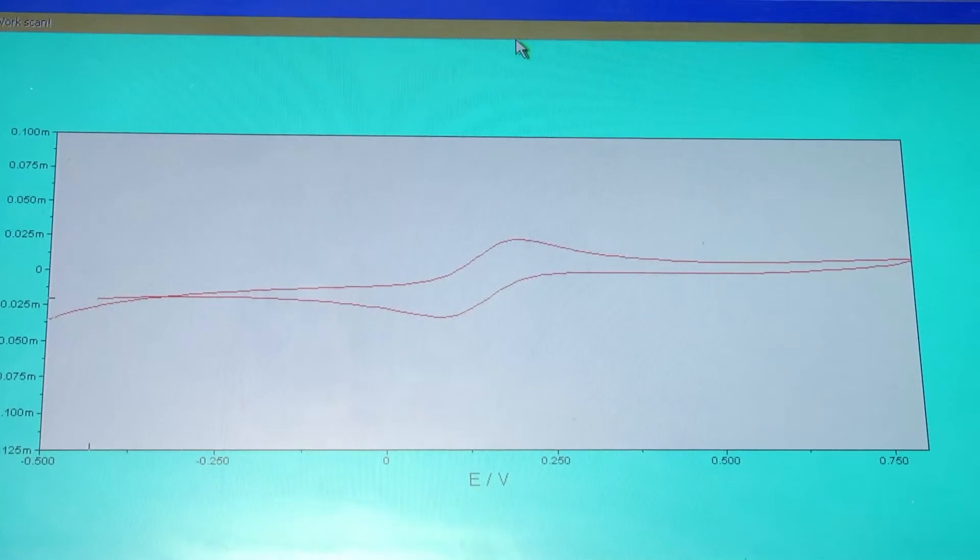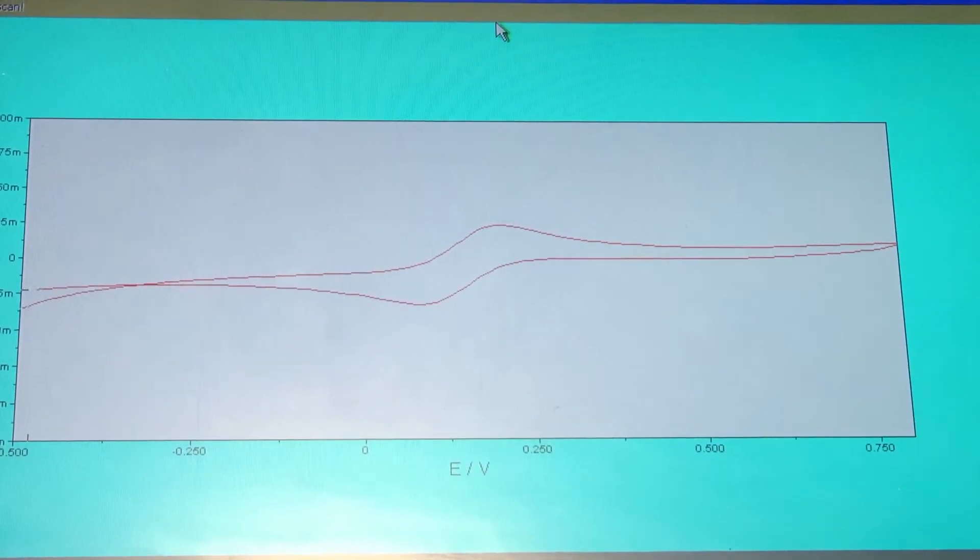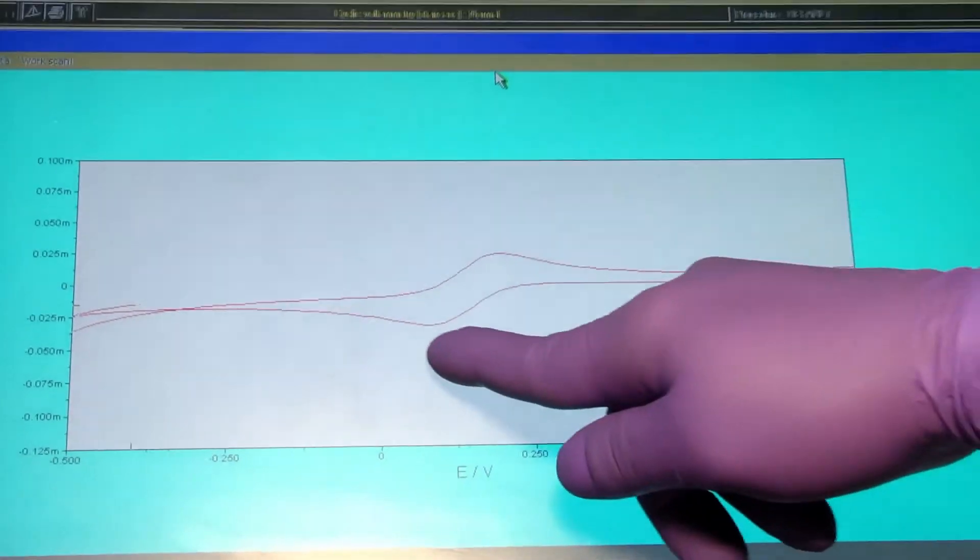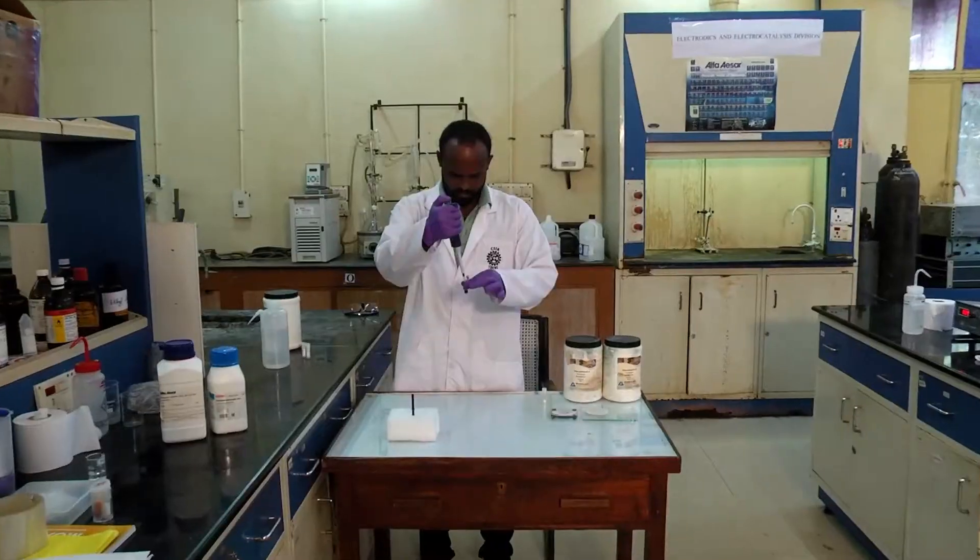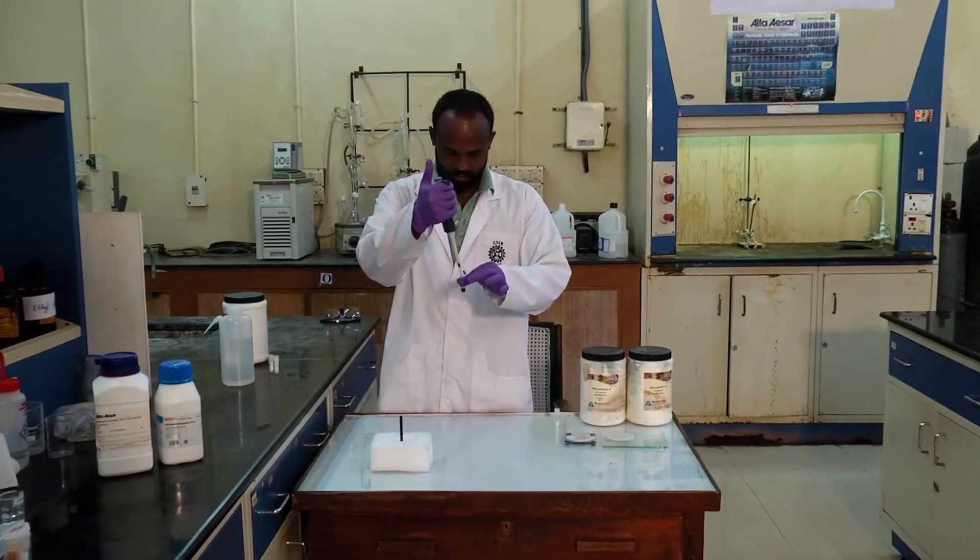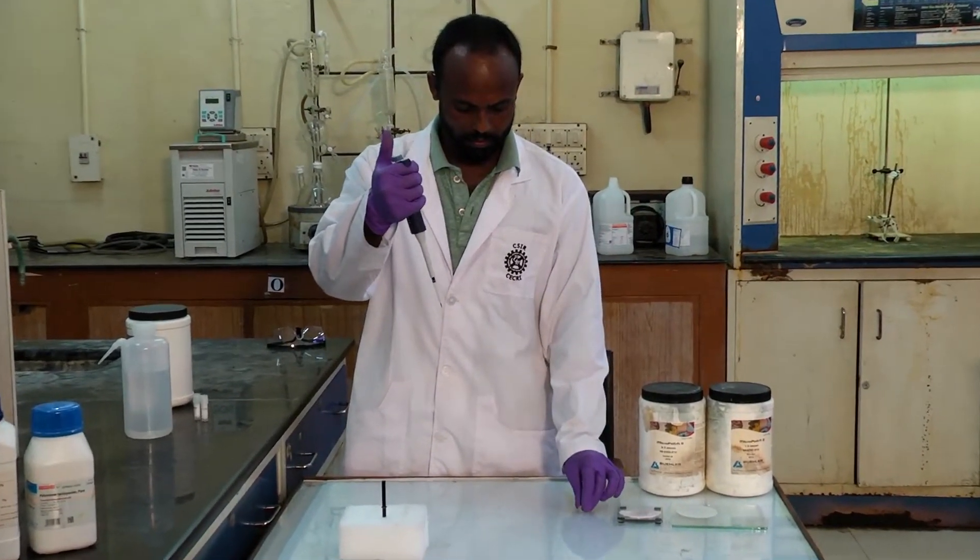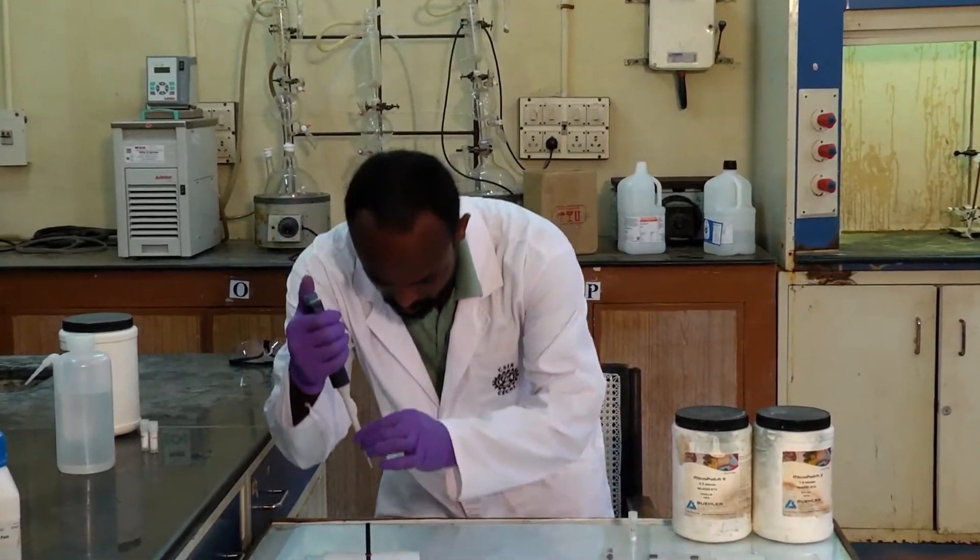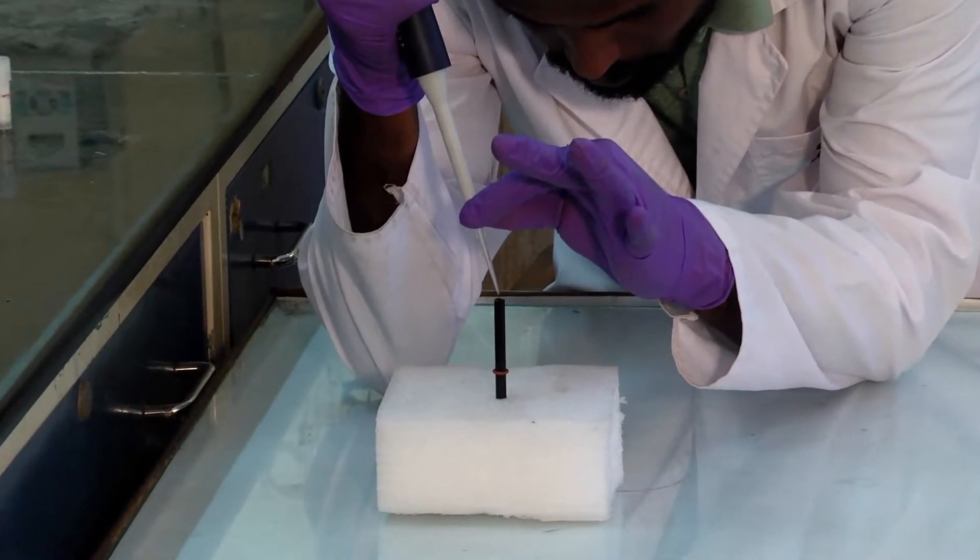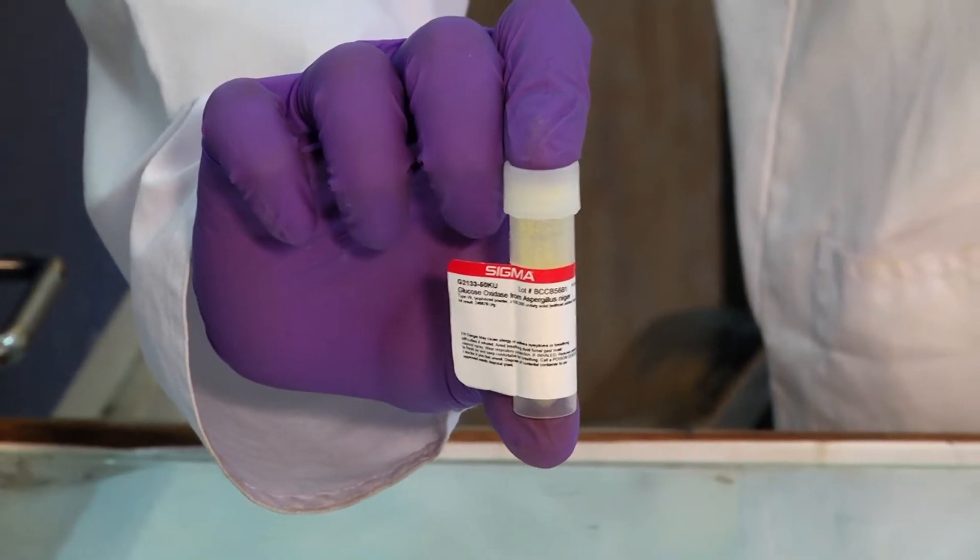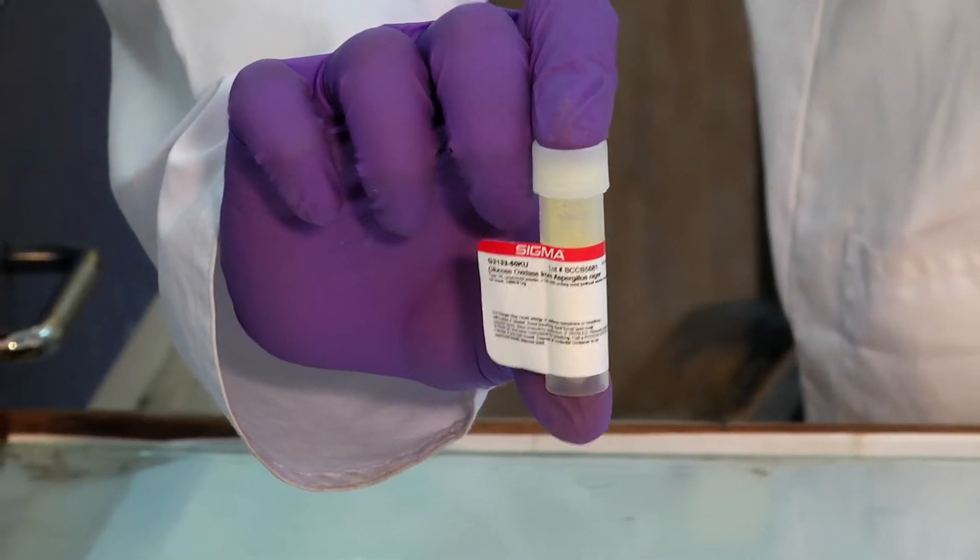Thus exhibiting a perfect reversible reaction. The formation of redox peaks confirms the surface cleanliness of the electrode. After that, a dispersion of 1 milligram per milliliter of multi-walled carbon nanotube in isopropanol water mixture was prepared. An aliquot of 10 microliters is drop-coated on the surface of cleaned electrode.